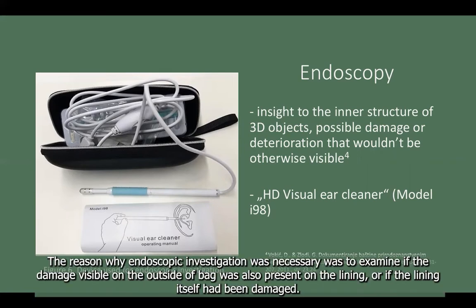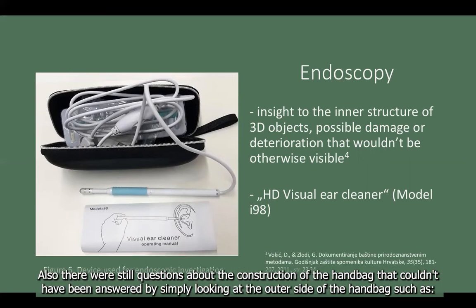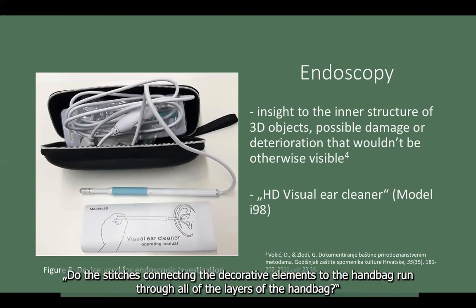The reason why endoscopic investigation was necessary was to examine if the damage visible on the outside of the bag was also present on the lining, or if the lining itself had been damaged. Also, there were still questions about the construction of the handbag that couldn't be answered by simply looking at the outer side of the handbag, such as, do the stitches connecting the decorative elements to the handbag run through all of the layers of the handbag?